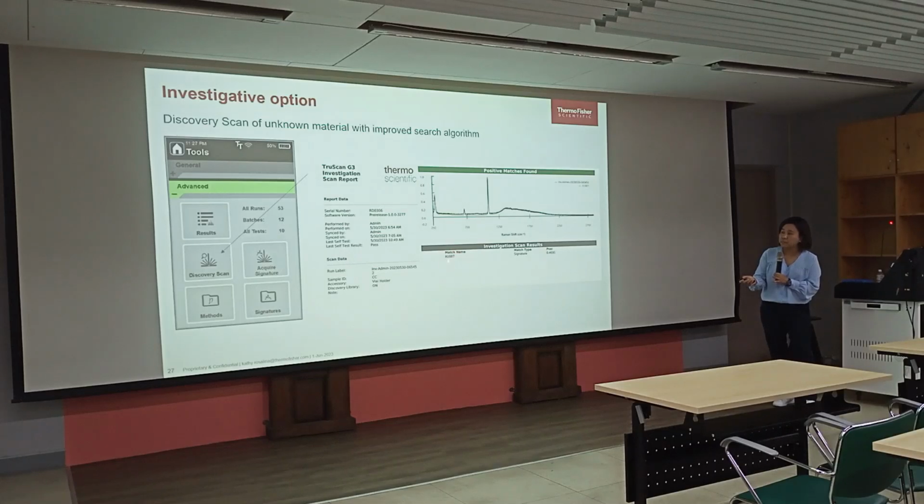So it shows that it matched with A1887, and the p-value is more than 0.05, it is 0.4691, which means this material has a good match. Later I will also do this test to show you how this investigation option works.